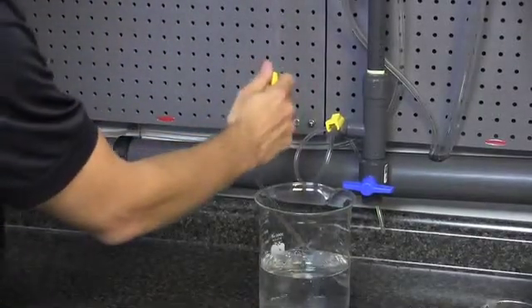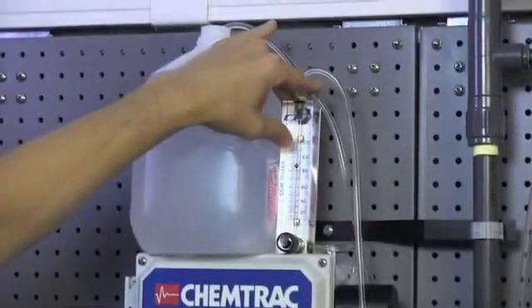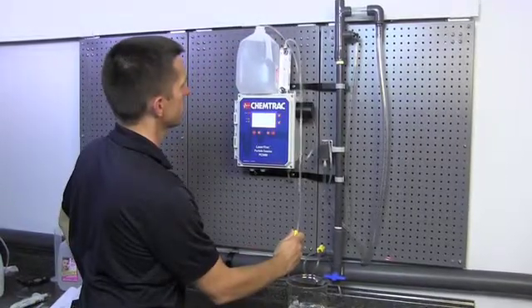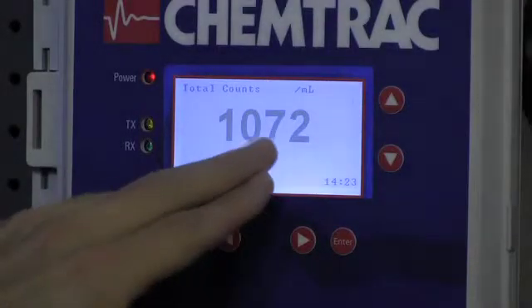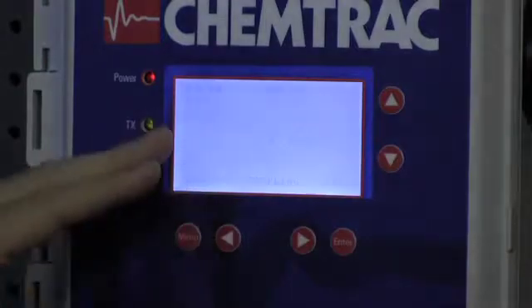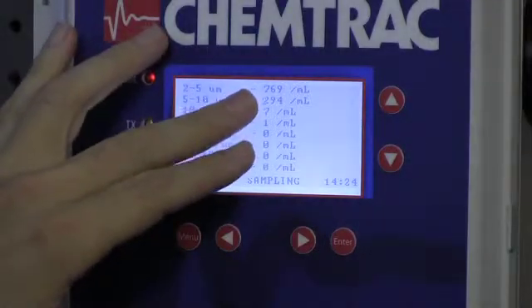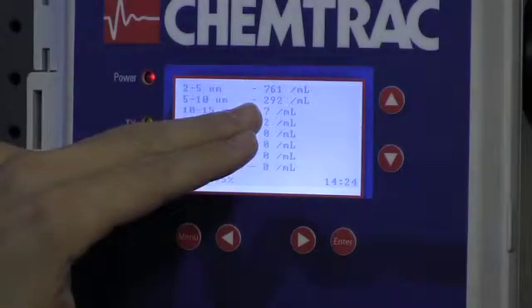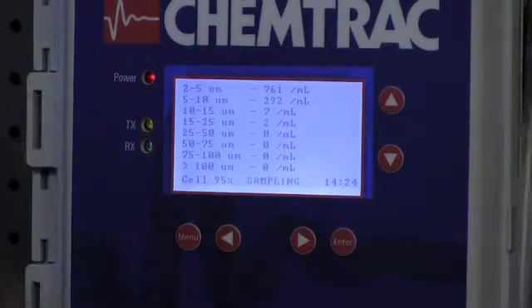Now we're going to adjust our flow for 75 mils per minute. We're seeing the total counts that we expected to see, and that includes that 50 background counts. So we're very accurate in terms of count accuracy. Where we need to make an adjustment is in our sizing accuracy. Because right now, approximately 70% of the particles are appearing in the 2 to 5 micron channel, and 30% are appearing in the 5 to 10. What we'd like to have is the perfect 50-50 split, but we need to have at least a 60-40 split or better.